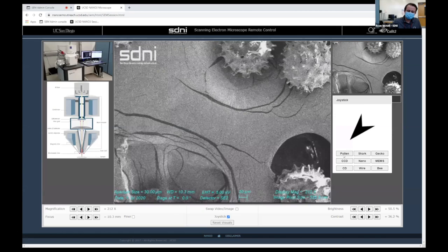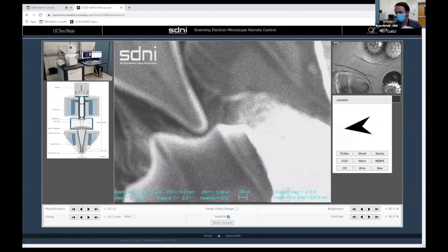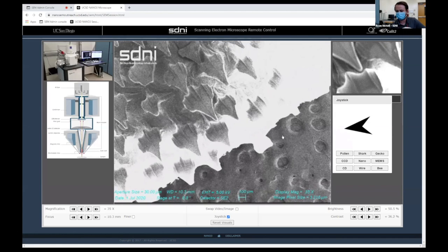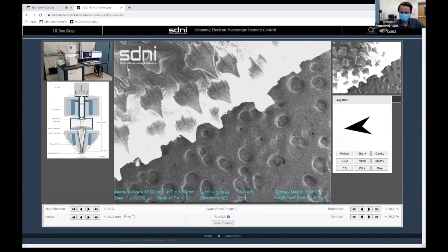Yeah, so the whole idea here is that this is about a $500,000 microscope. It's what's used by real researchers. I'll help you zoom out a little bit. This is used by real researchers, and we can see down to the nano scale, which is basically a billionth of a meter. It's about 1,000,000 times better than an optical microscope. So you're looking at shark skin that we got from the Salk Institute right here on the West Coast. Go ahead and click somewhere further into the skin. Top left. That's the edge of the skin.